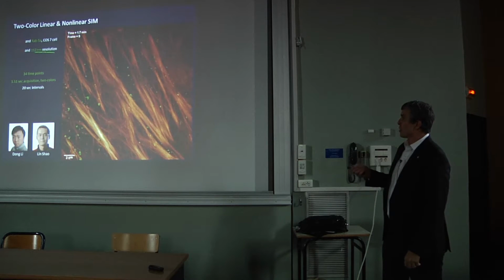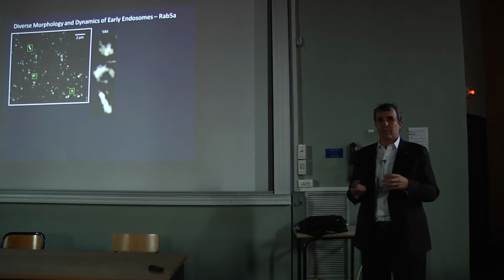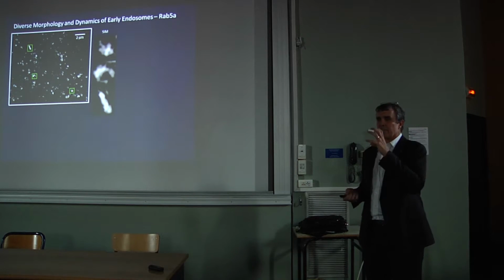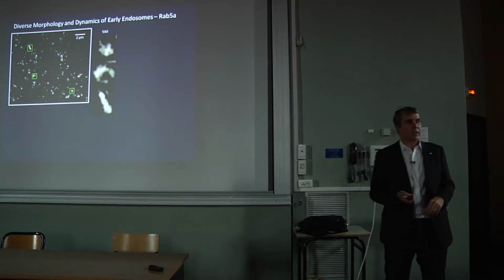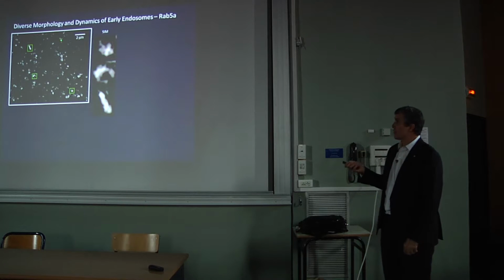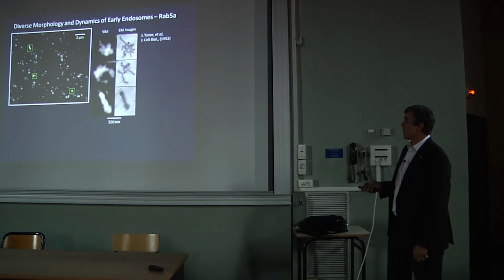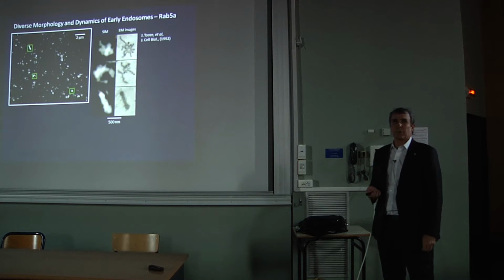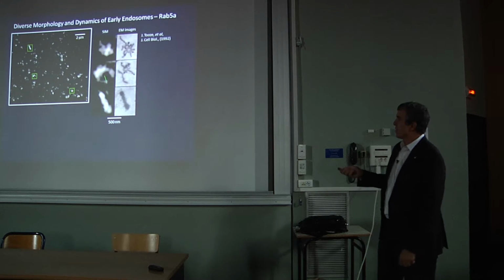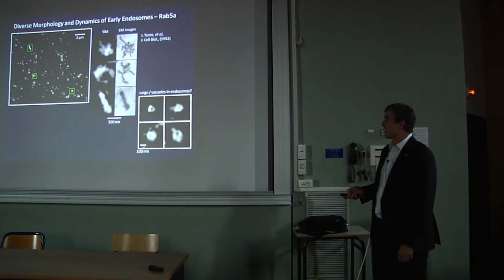And so these green blobs are those guys. You can clearly see that at this point, these endosomes don't have a stereotypical round shape like the clathrin-coated pits, but have various strange, weird-looking shapes. I picked out 3 particular examples here that I liked, and I liked them because they matched some EM pictures from a 20-year-old paper. So we can start to clearly resolve some of the shape of these endosomes.